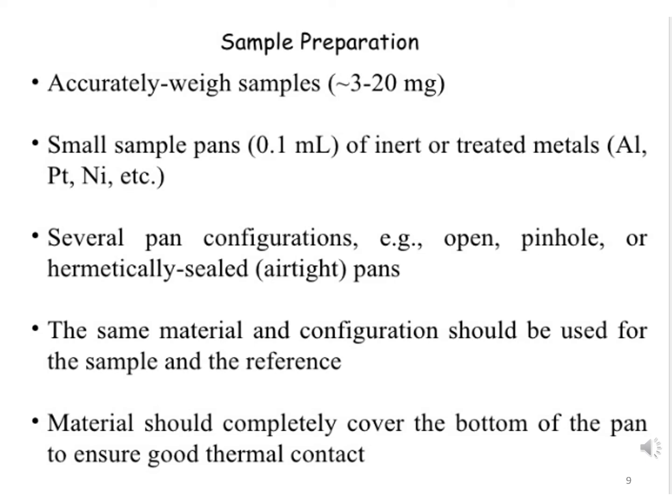The arrangement of the sample material in the sample and reference pans should be similar, arranged in the same manner, with similar contact with thermocouples or heaters, kept at the same position.